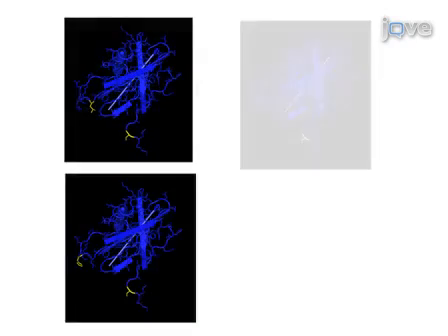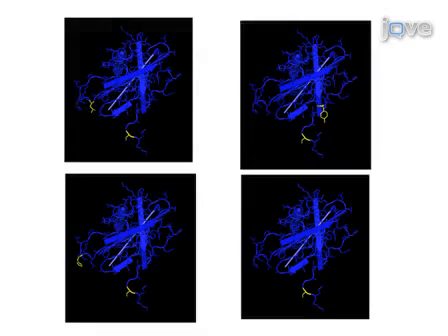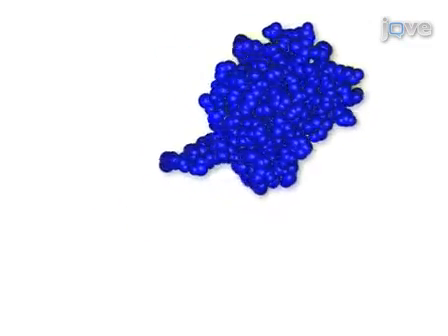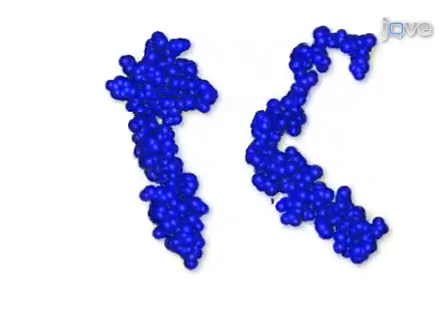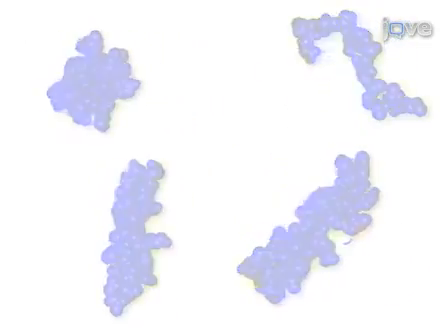To determine how each of the interacting residues affects the cystatin B Papain interaction, several cystatin B variants are produced via site-directed mutagenesis. In such experiments, there is always the possibility that recombinant proteins will not fold correctly, aggregate, or deteriorate, leading to incorrect and irreproducible results.